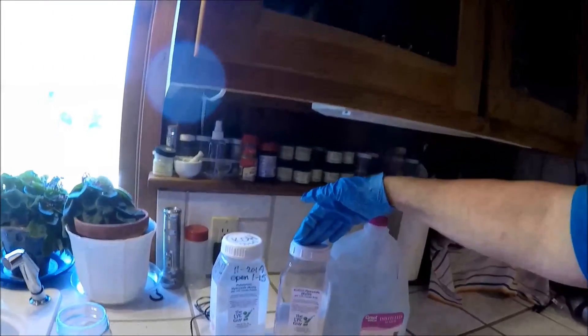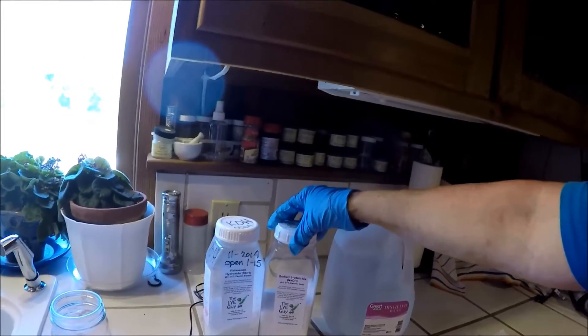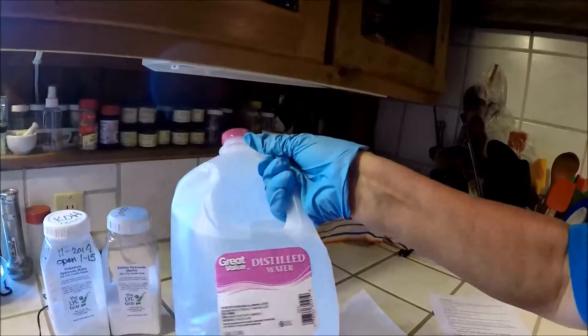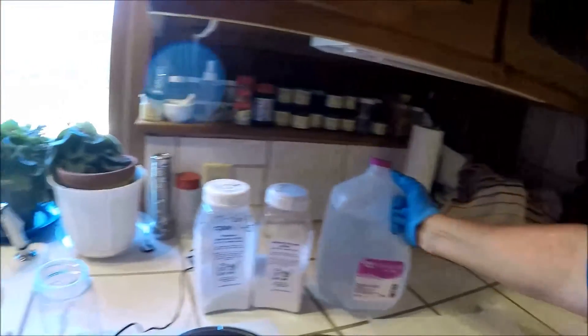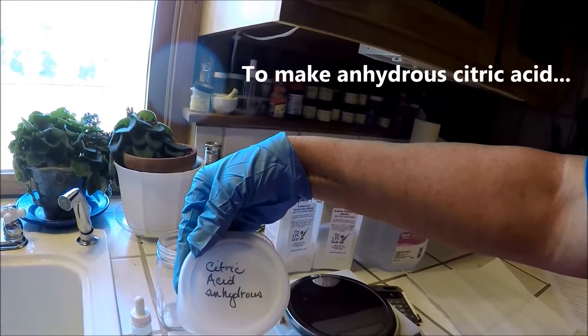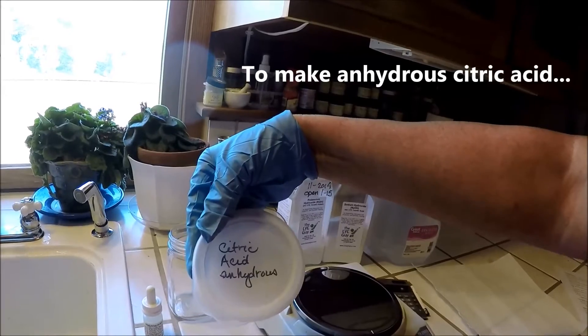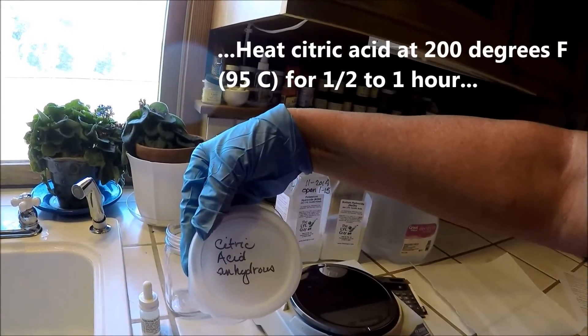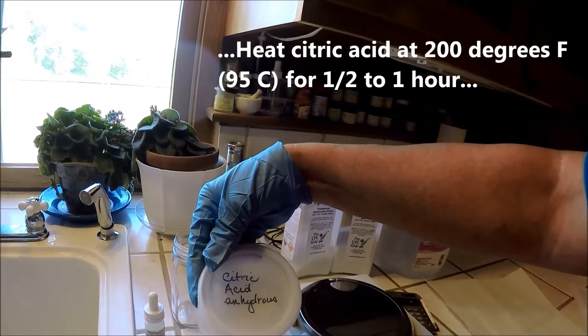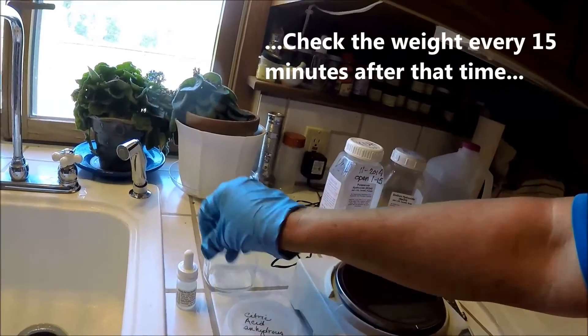In addition to the lye, whichever one you're going to use, or your alkali more properly, you also need some distilled water — I have some from Walmart. You need to have anhydrous citric acid, and I'll give a method for making sure your citric acid is anhydrous, meaning water-free — just the citric acid, no extra water on it.